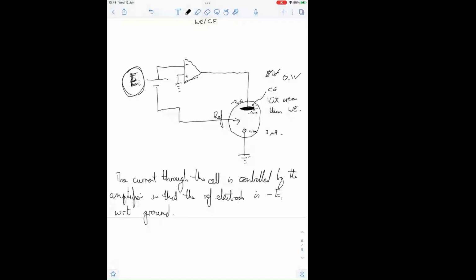Another thing we might want to do, because of that possibility that horrible reactions are going on at my counter electrode, is to put my counter electrode behind a frit, so that the products of that counter electrode reaction are not leaking into my system and interfering with it.